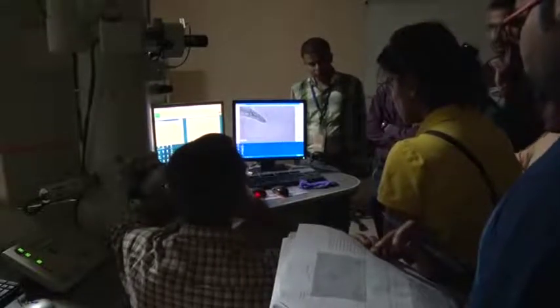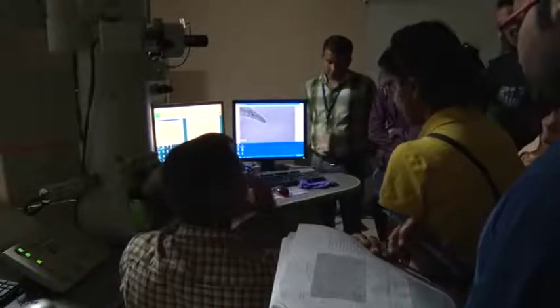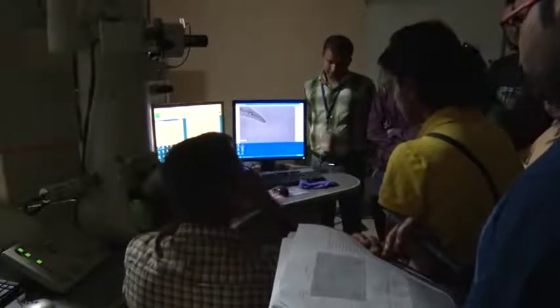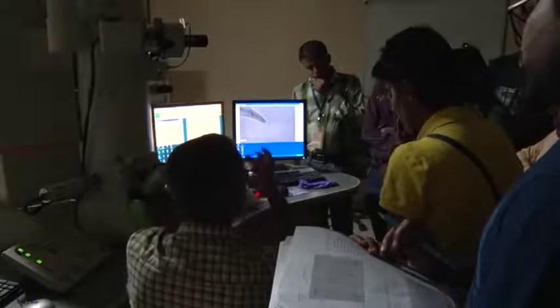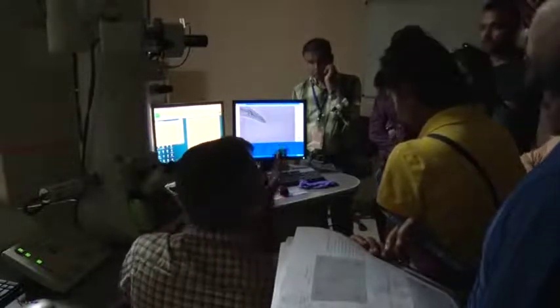If the axis of the objective lens was aligned on the optic axis of the microscope, then this change in magnification should only make my image look smaller or bigger. But if the axis of my objective lens is slightly like this and not like this, then it will make the image vibrate, because it will magnify differently. So that's why it is not on the optic axis, not in the center.